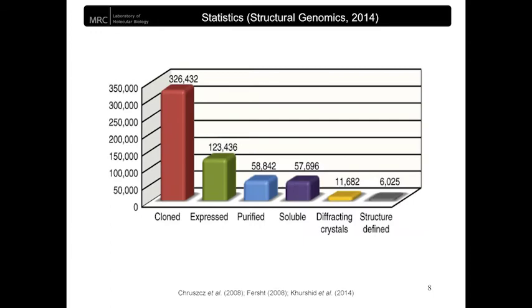Using recombinant DNA technology and protein engineering, crystallographers now spend a lot of time trying to obtain samples of interest that can be crystallized. This histogram, produced by the group of Naomi Chayen at Imperial College, results from compiling data of structural genomics. We can calculate that 18% of soluble samples come from initial clones, and about 1 out of 10 soluble samples will later enable structure determination.